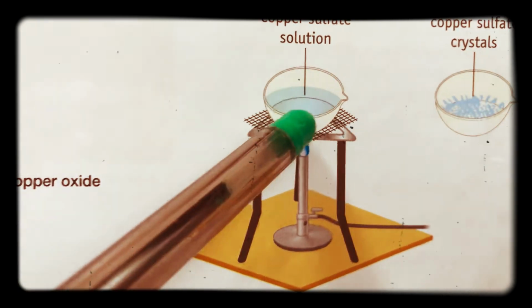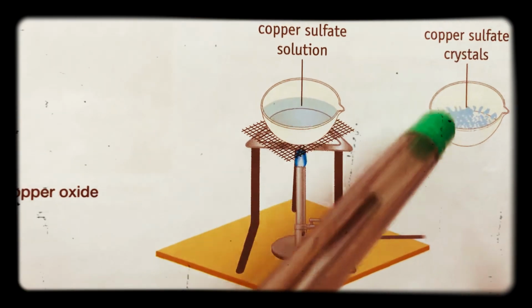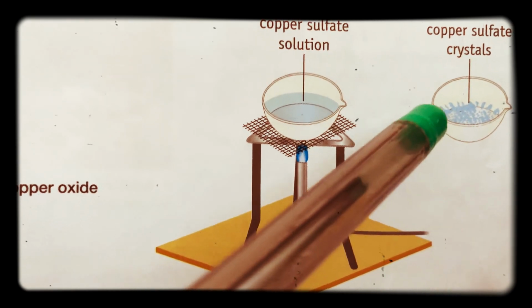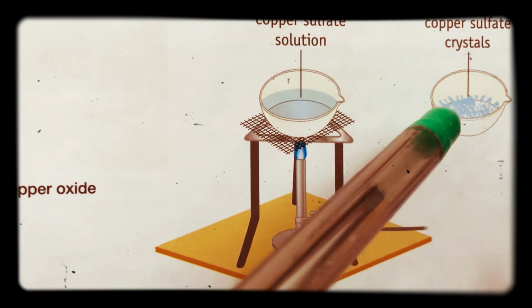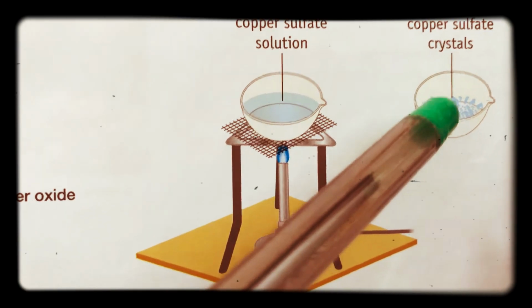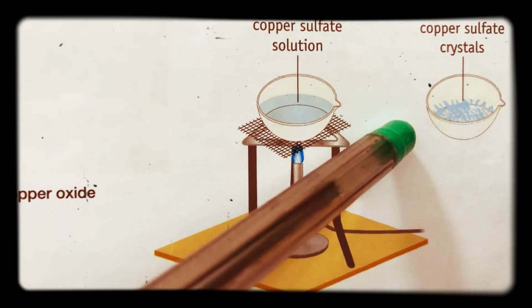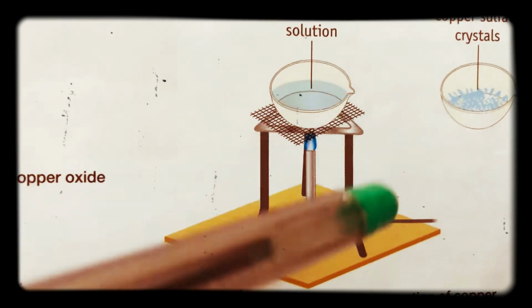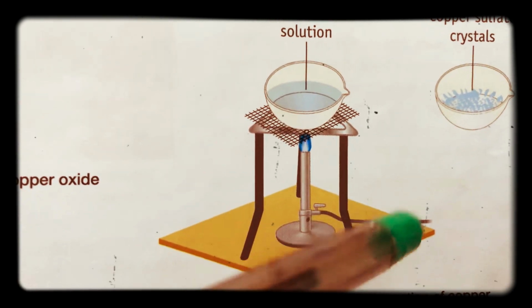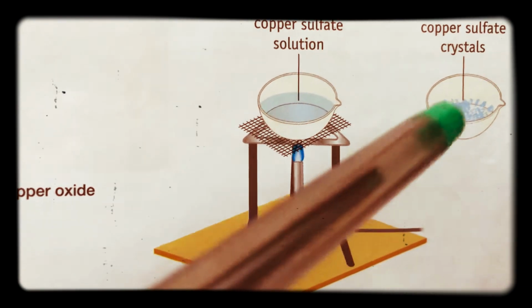Now, if you can do that, you let the crystals form, keep it in a warm place, let the rest of the water evaporate. Usually it's overnight. You'll start to see crystals forming within an hour, but overnight you then see that the rest of the water evaporates, and then you have these copper sulfate crystals. And if you have a little bit of water left over, then you can use a pair of tweezers, take them out, and you can put them on a paper towel. You can dry the crystals and make sure that they're not wet, and you then have pure copper sulfate crystals.